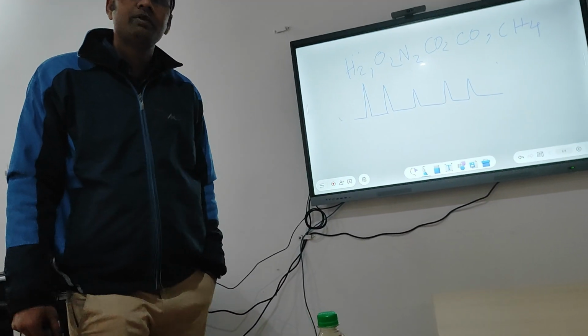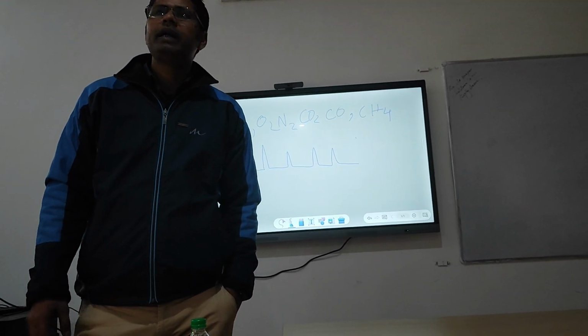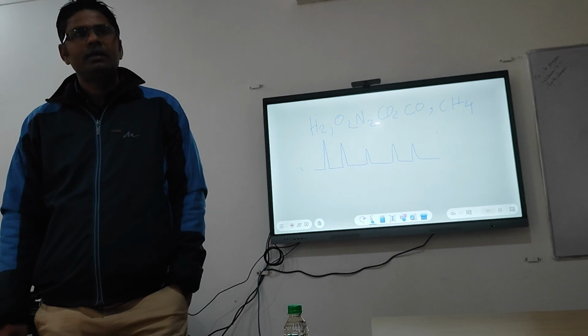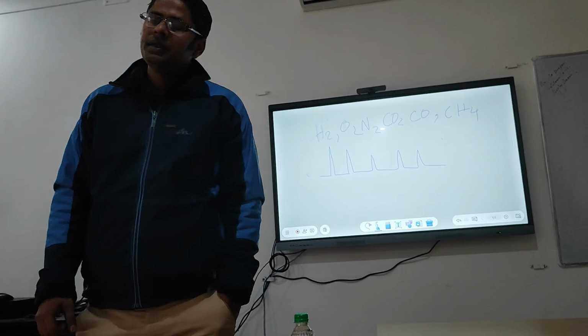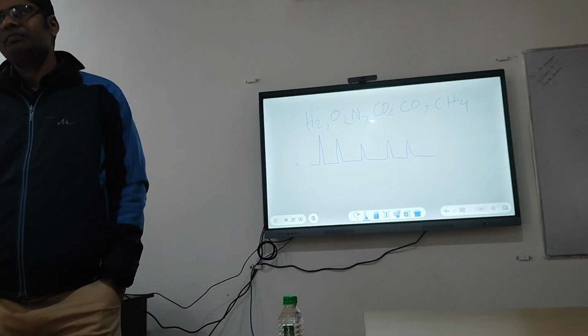Normally we use three types of capillary column. It depends on their ID. 0.25 mm is a very narrow bore capillary column, the next one is 0.32 mm ID, which is a medium bore capillary column, and 0.53 is called a mega bore capillary column, similar to a packed column. So now we will hear about the packed column.